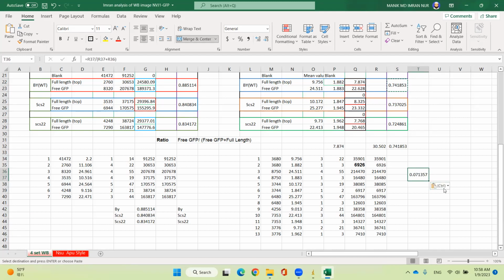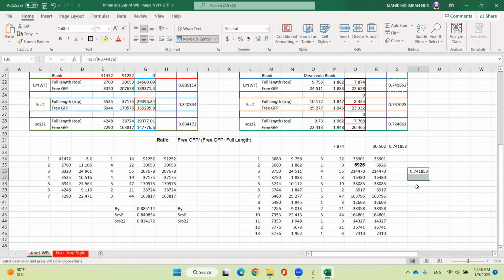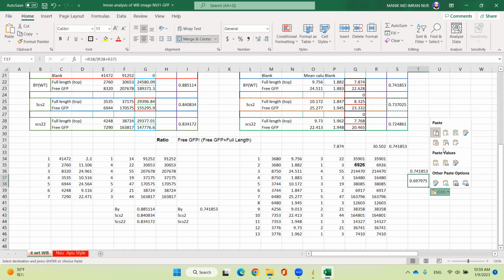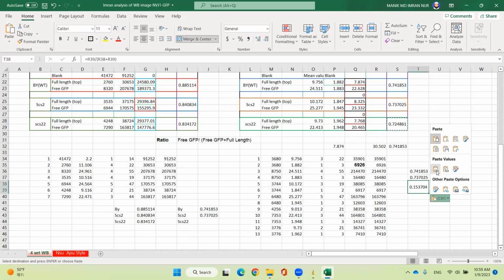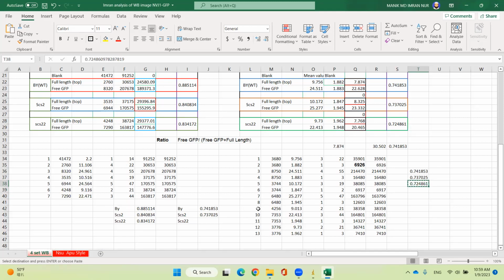The bar diagram perhaps will show us the actual figure or correlation between these two methods. Since the two methods have different types of values, the height of the bar diagram might give us an insight.